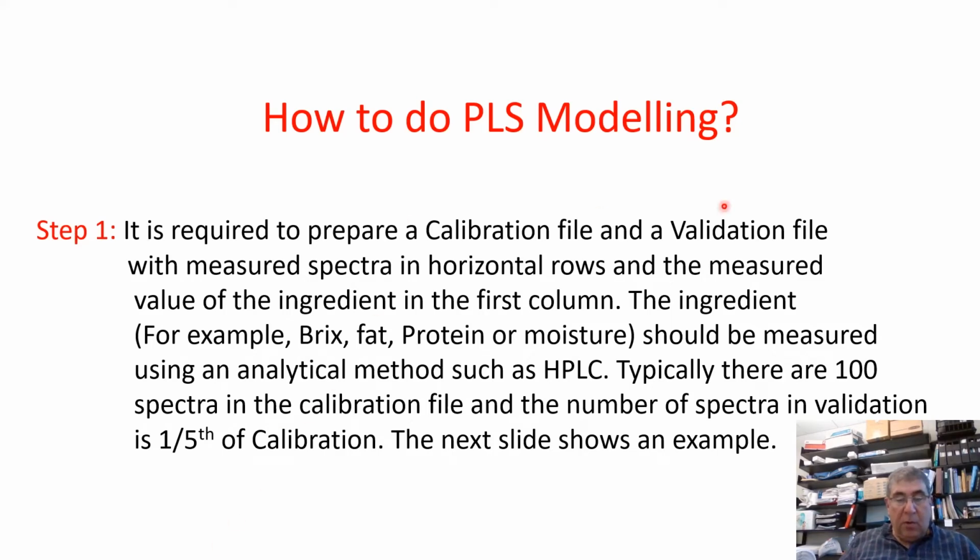Hello, in this video I'm going to describe how you can do the PLS modeling using the NIRVA cloud platform and the measurements from NIRVAScan. We had many customers who asked about this, so I thought of recording this video to explain it.